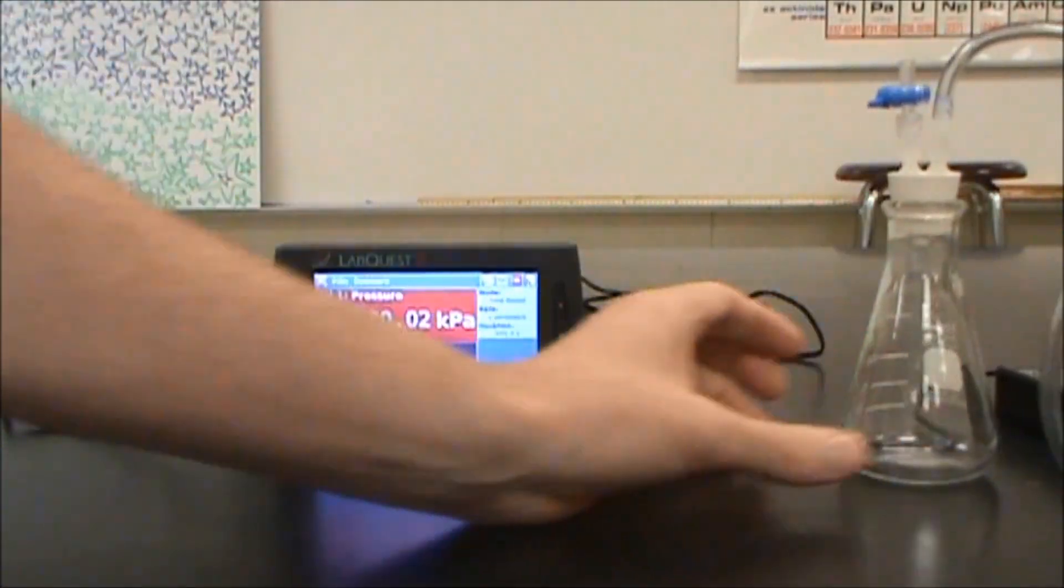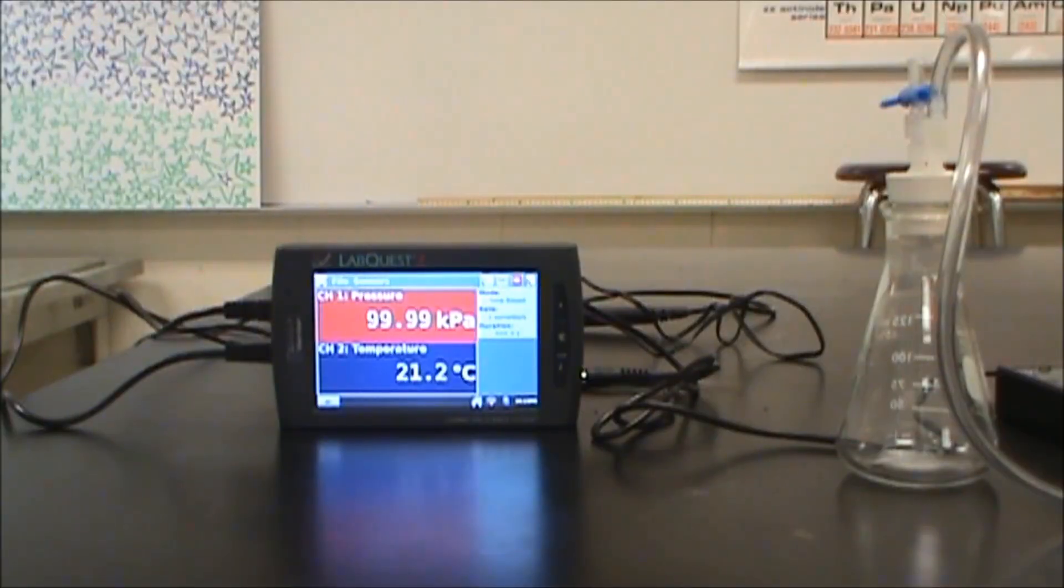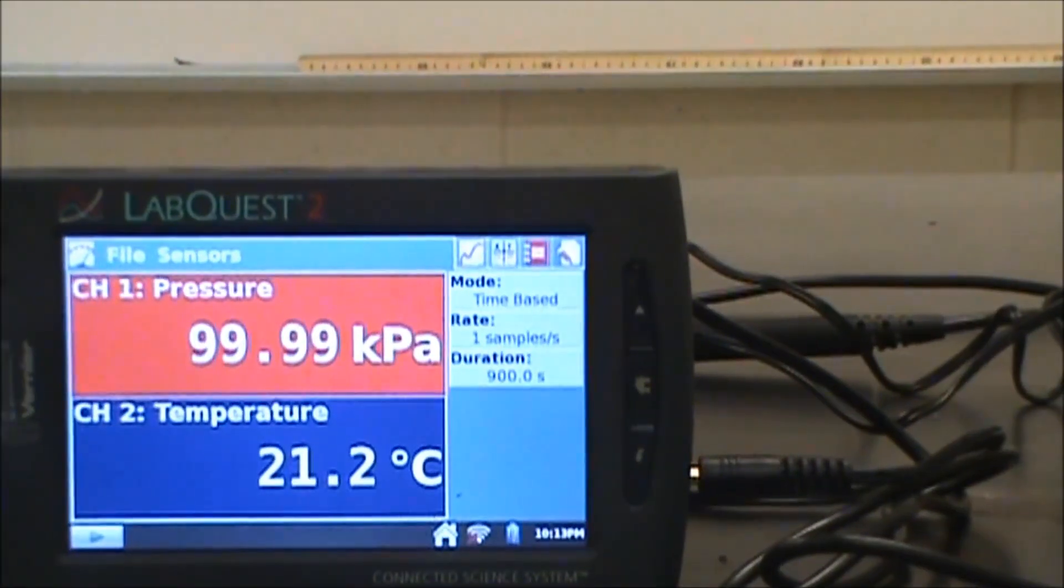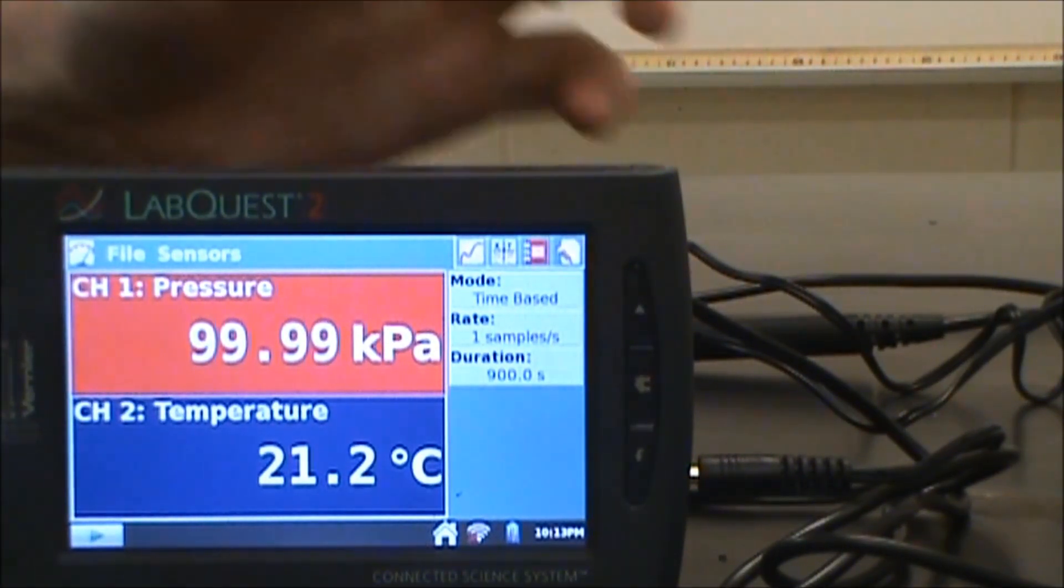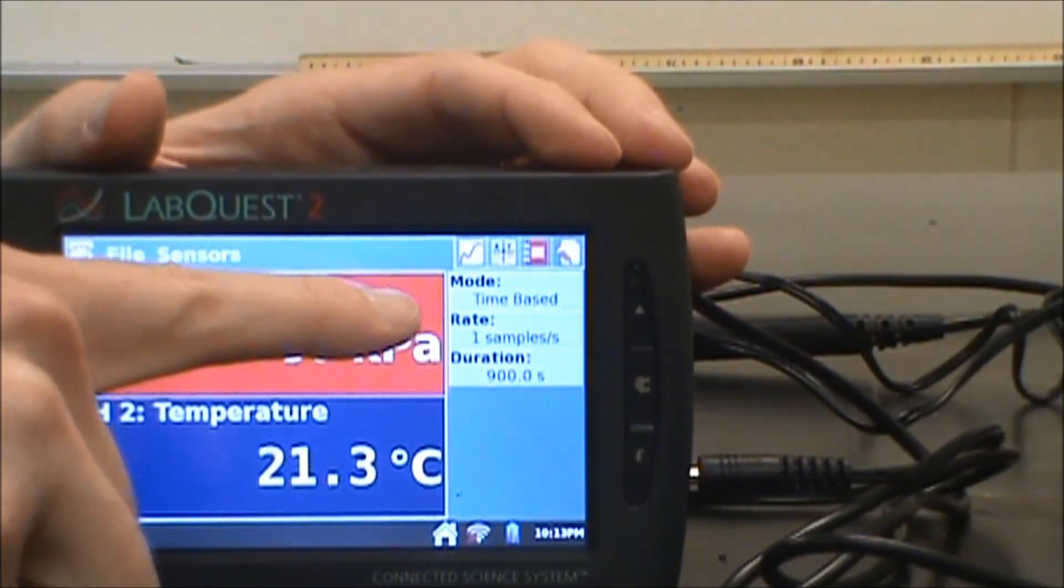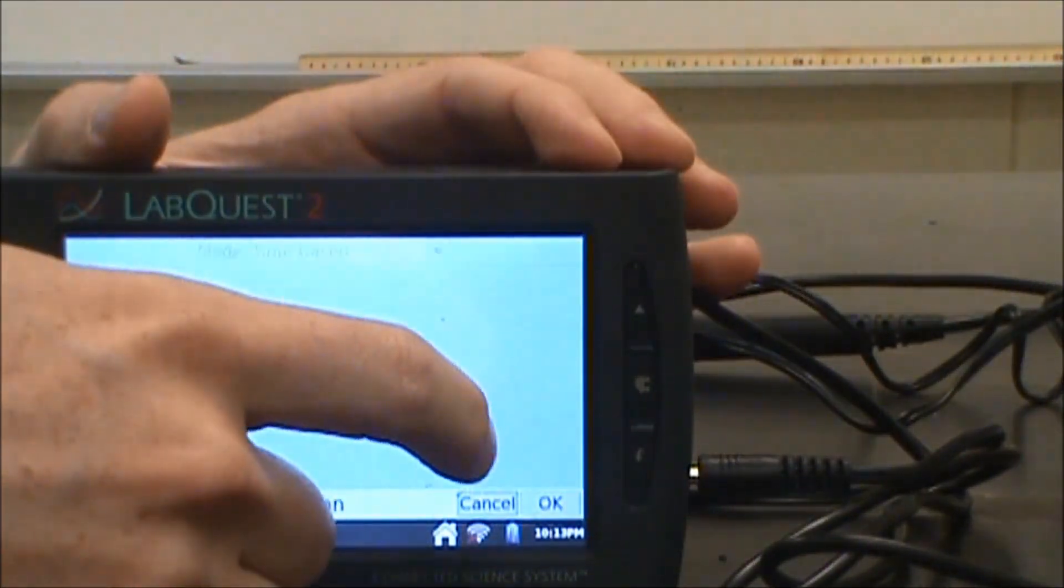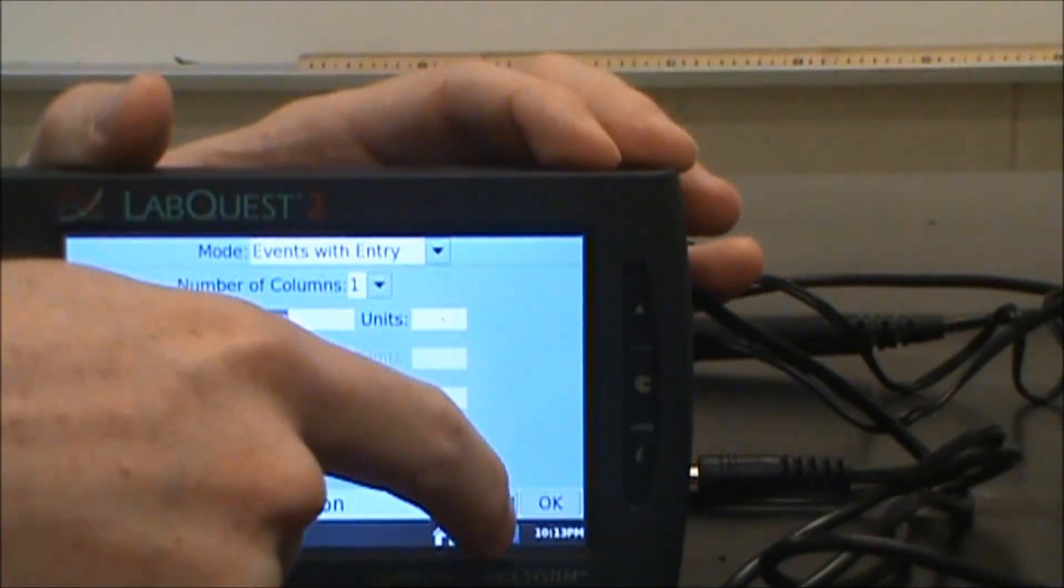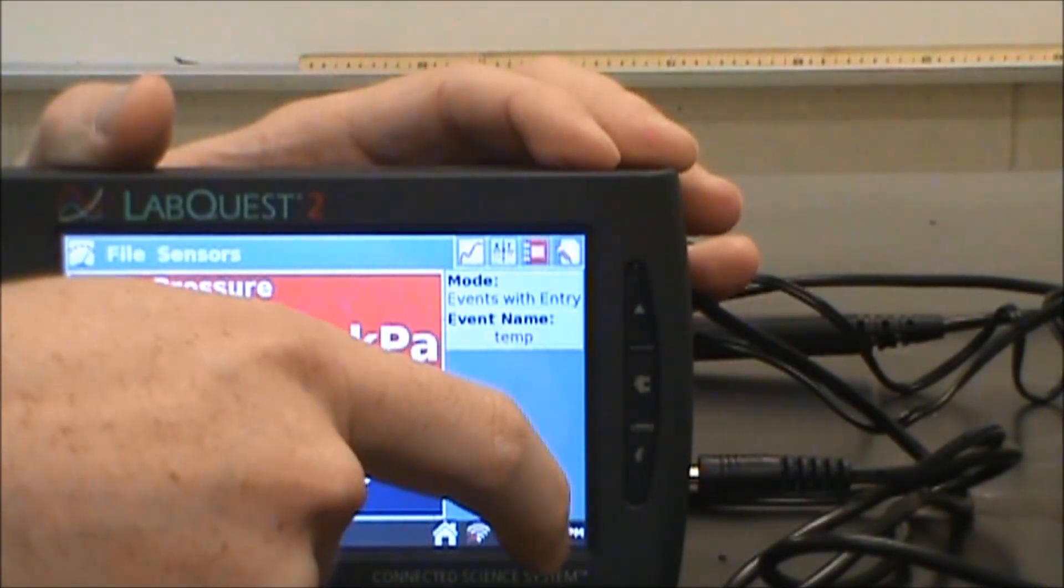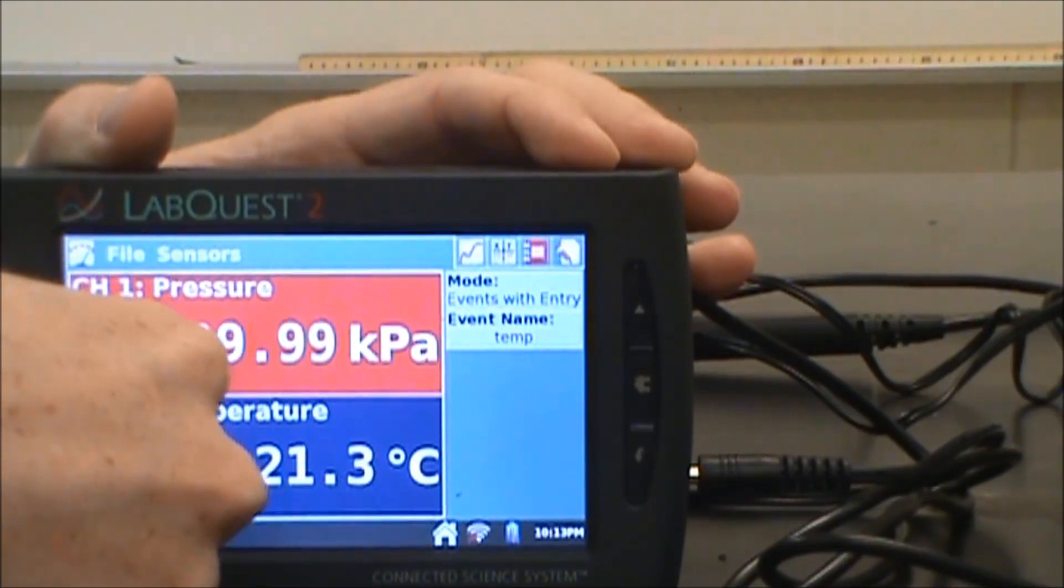Right now this is giving me the pressure inside of that flask. What I want to do is show you how to give you that in a graph form at various temperatures. The first thing I'm going to do is go to where it says mode time-based, click on that, and I'm going to go from time-based to events with entry. I'm going to hit OK, and then I'm going to hit play.